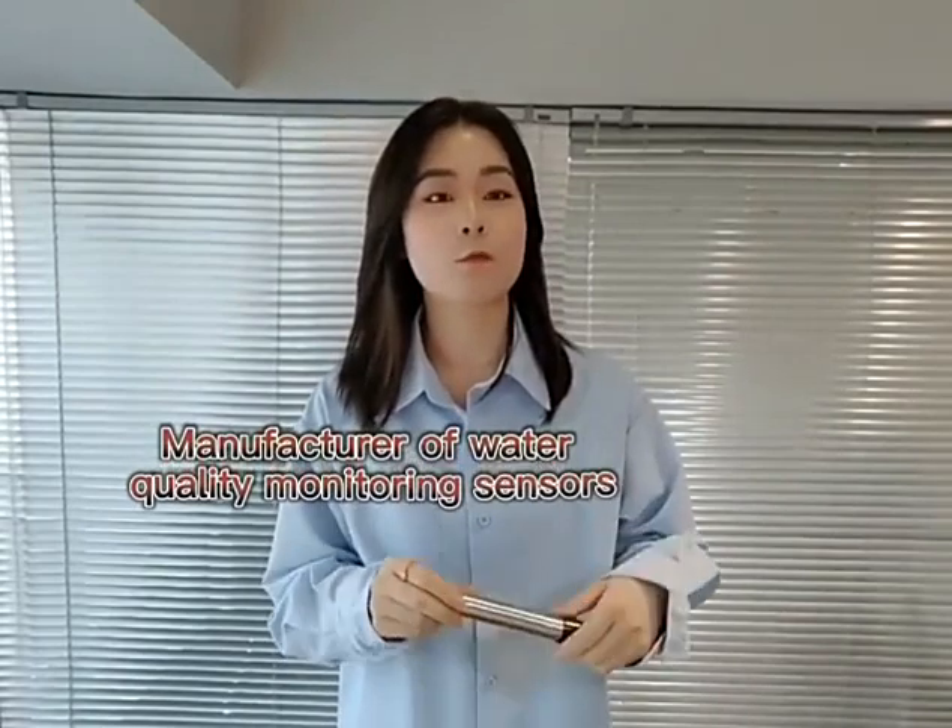Hi guys, my name is Sofia and I come from a manufacturer of water monitoring sensors in China. Today I will introduce one of our sensors to you — have a guess what it is!